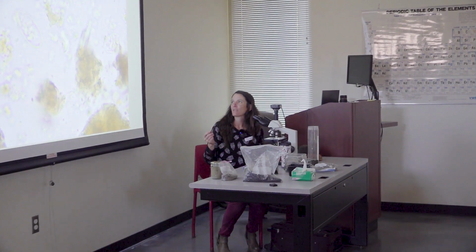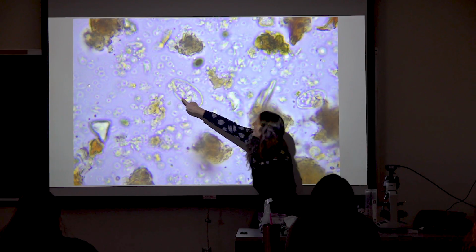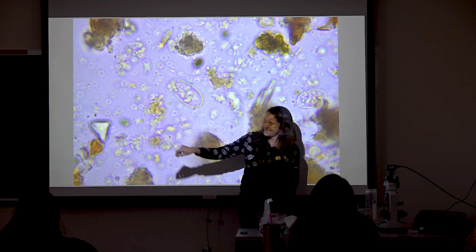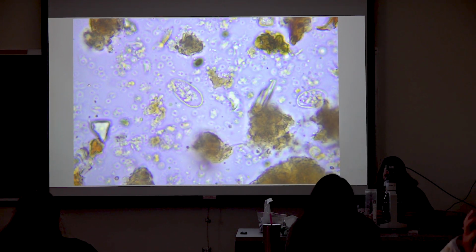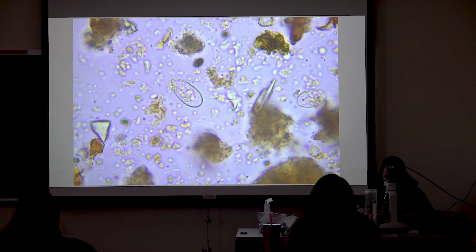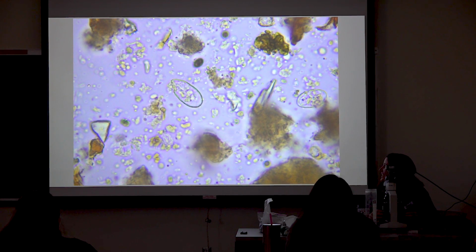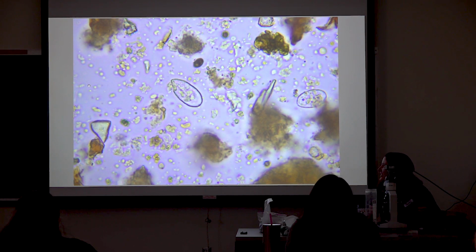And because of that, we can tell, oh, is he coming out? Is that him? Did we wake him up? Y'all were so excited to see him awake. I think he might be doing it. He is.